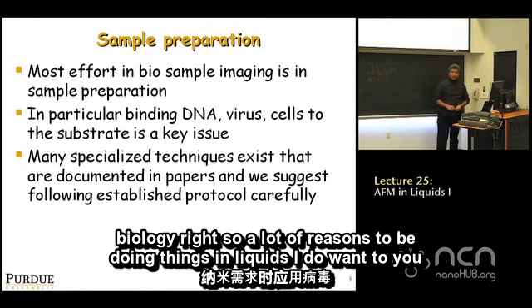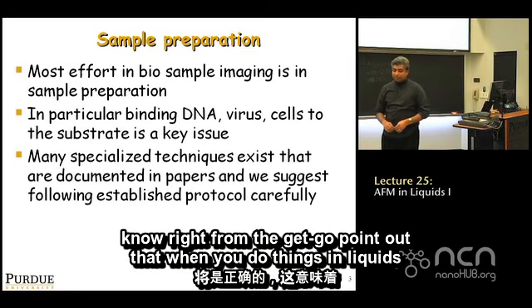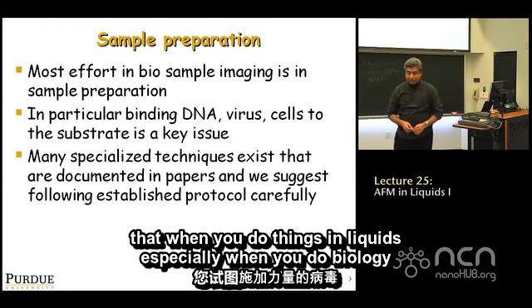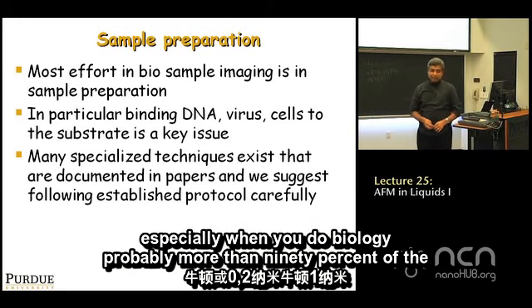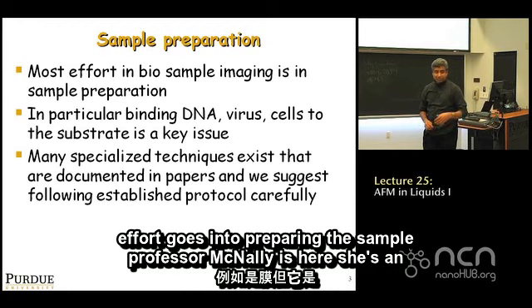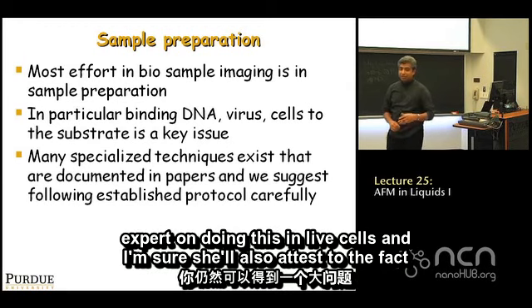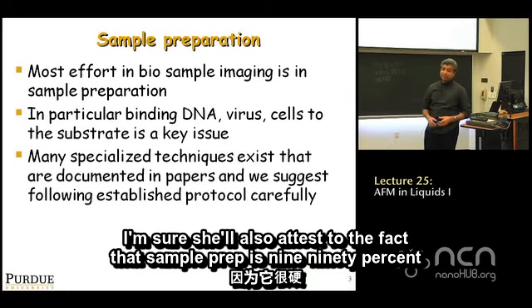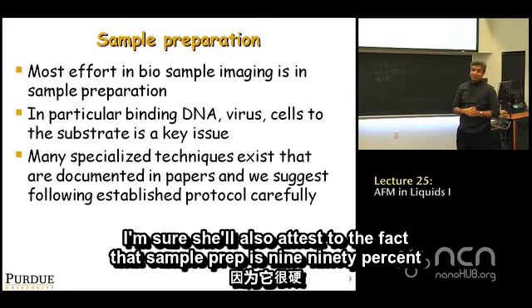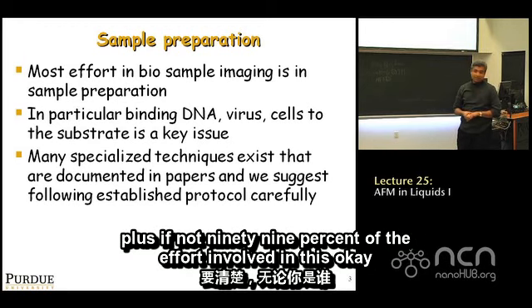I do want to, right from the get-go, point out that when you do things in liquids, especially when you do biology, probably more than 90% of the effort goes into preparing the sample. Professor McNally is here. She's an expert on doing this in live cells, and I'm sure she'll also attest to the fact that sample prep is 90% plus, if not 99% of the effort involved in this, okay?